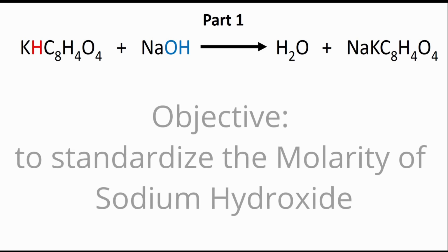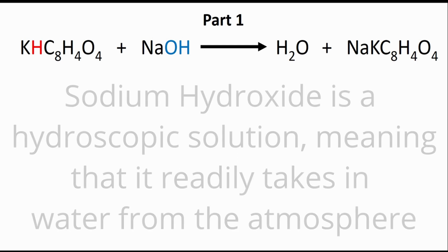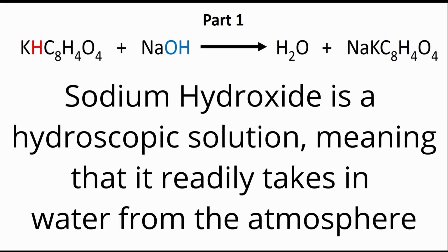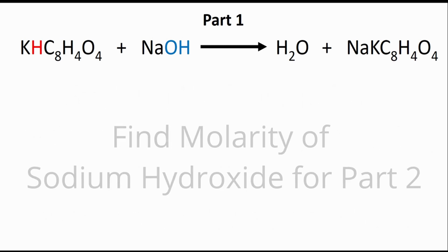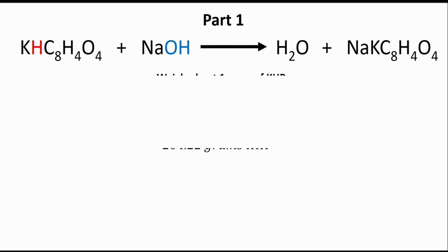So in part 1, our objective is to standardize the concentration or the molarity of sodium hydroxide. Since sodium hydroxide is a hygroscopic solution, meaning that it readily takes in water from the atmosphere, we need to be sure that we know exactly its molarity before we do part 2.